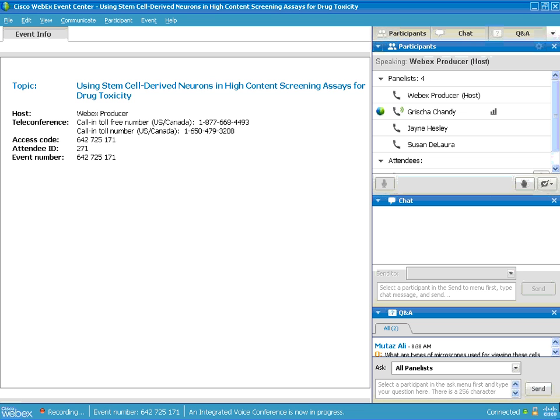One of the questions was about purity and whether you've looked for quantification of glial cells that come up in cultures, specifically GFAP. Yes, I've got a couple different questions jotted down here that I've taken off of the Q&A. One of them was wondering if we stain our neurons specifically for GFAP, and if the glial cells start to appear or develop over time.